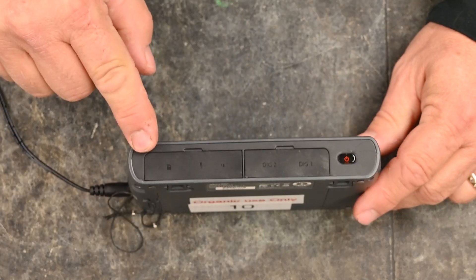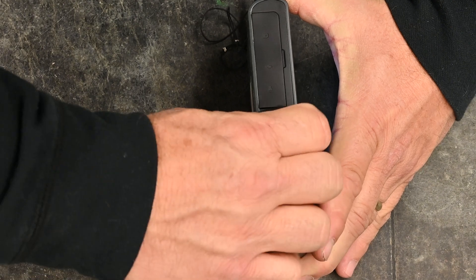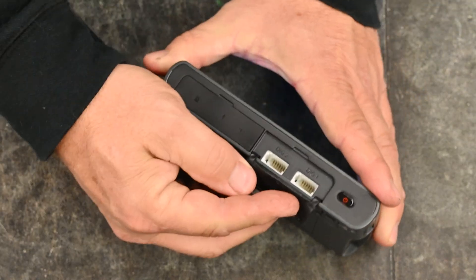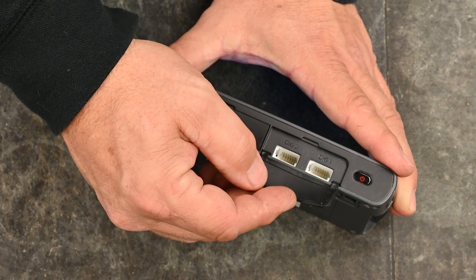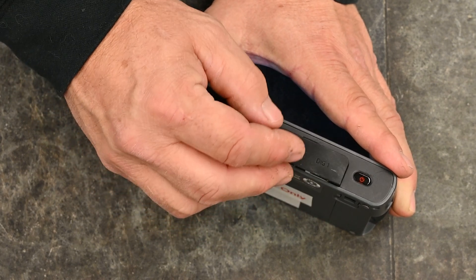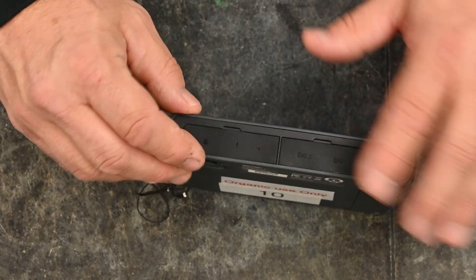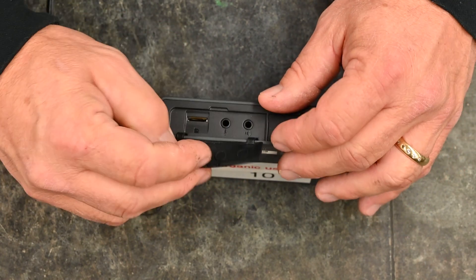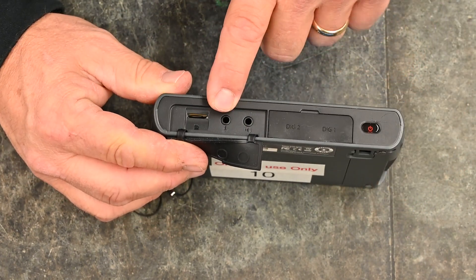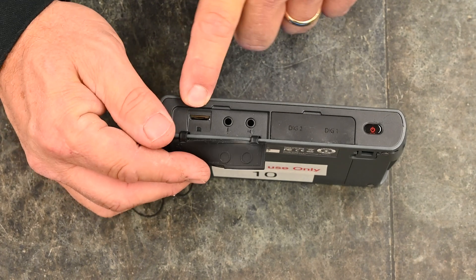On the same side as the red power button there are little black flaps. Under the first flap are the two digital ports, used with motion detectors and similar sensors — we will not need these with the introductory sensor package. The second black flap has three plug-ins: one for a speaker, one for a microphone, and one for a mini SD card.